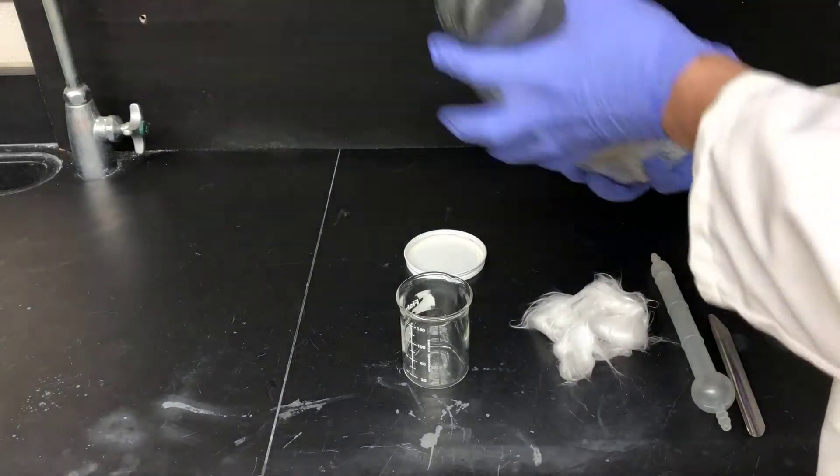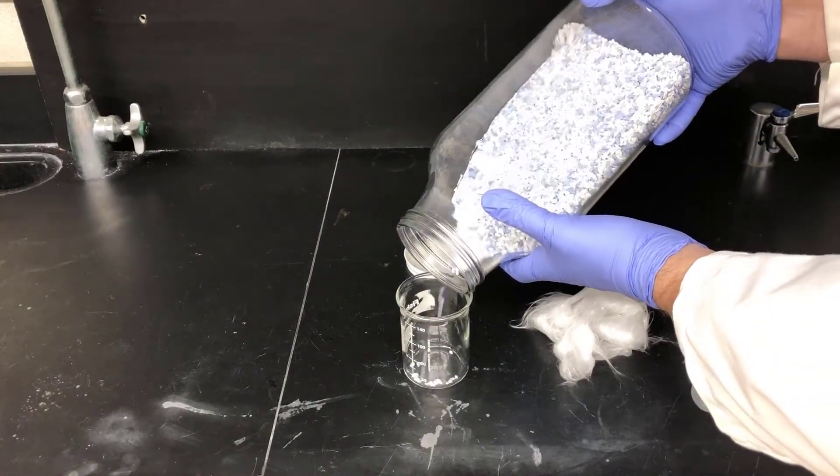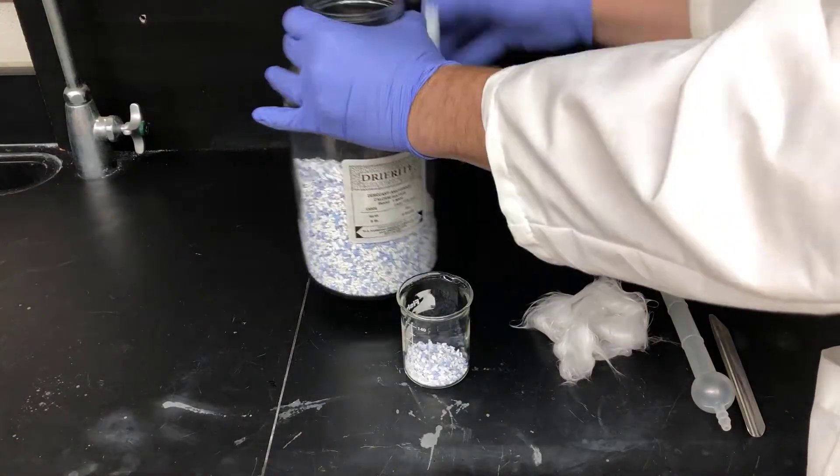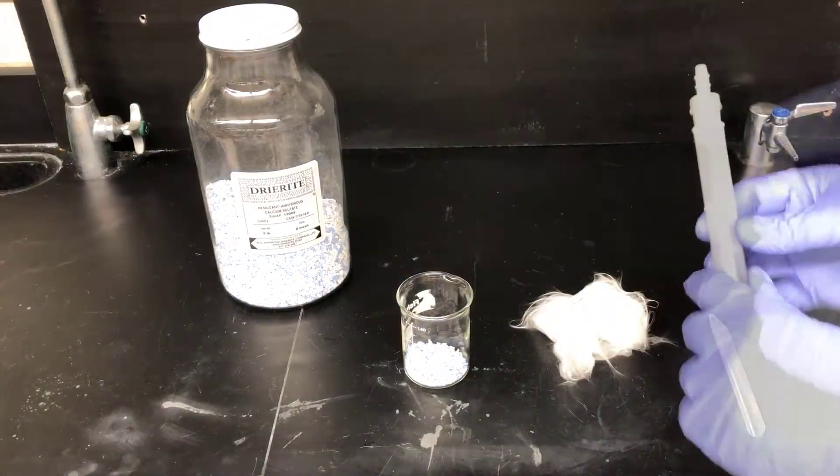Calcium sulfate is a white solid, but some of it has an indicator in it that's blue when it's good and can absorb moisture, and red when it's depleted and can't absorb more moisture, and then it's purple when it's somewhere in between. I've poured some of that dry-rite into a beaker to make it easier to load into the drying tube.